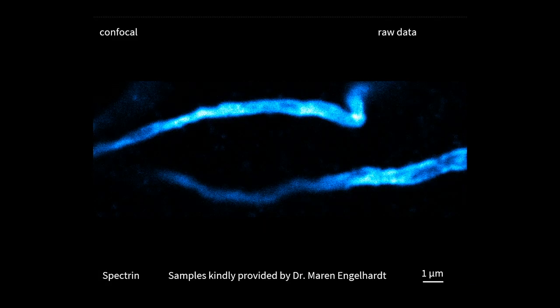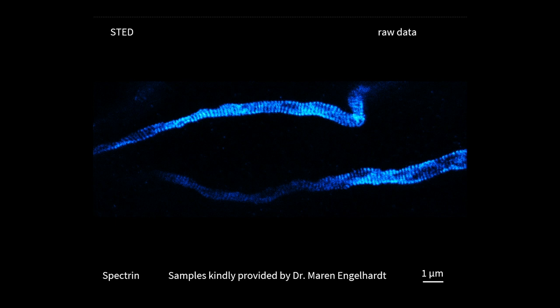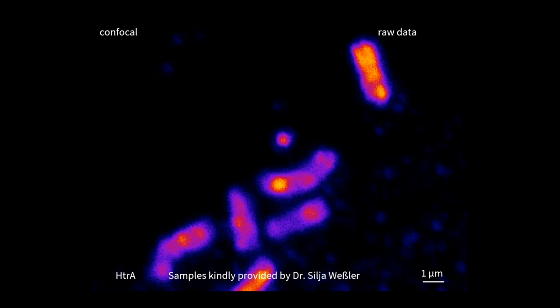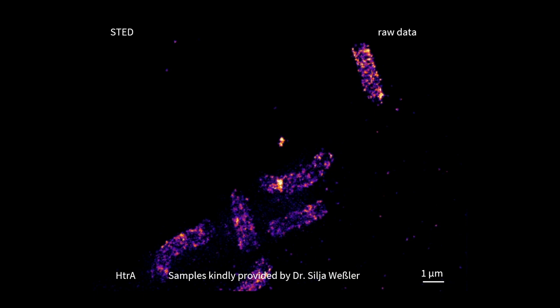To end the STEDYCON part, I'll show you some images. This is brain sections from mice — samples kindly provided by Maren Engelhardt from Mannheim. Stained is beta-4-spectrin, showing the axon initial segment. If you turn on STED, you see a really nicely shaped regular pattern of the beta-4-spectrin. These are bacteria acquired by Professor Silja Wessler from Salzburg. With STED on, you can nicely see basically every protein complex on the surface of the bacteria, which were not seen by confocal before.